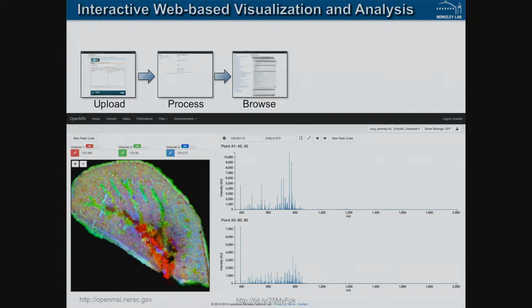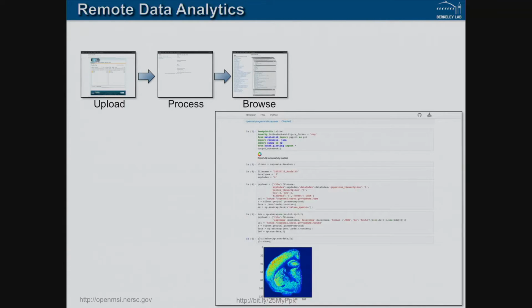Before we built Open MSI, the competing commercial software would take hours to register one image. And that's because it had to do these serial read operations. So the data was stored spectrum, spectrum, spectrum, spectrum, but a person wants to read an image. So they have to go read a little tiny bit, skip, read, skip, read, skip. So it would take hours. And so we simply did some clever things in HDF5 with data duplication and chunking. They made it go really fast.